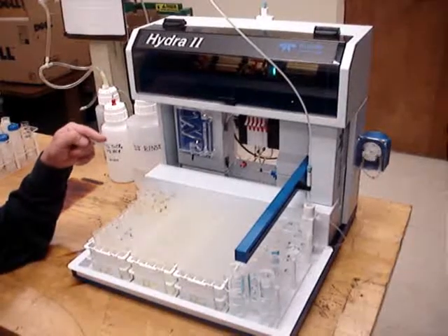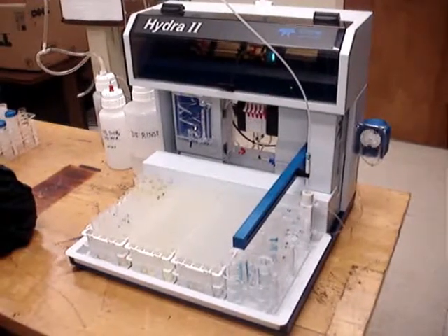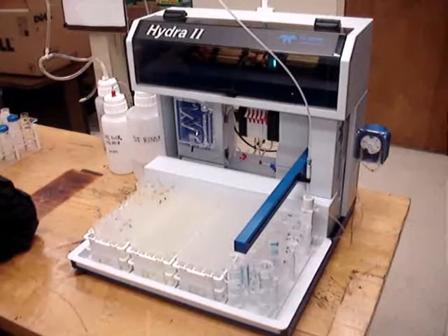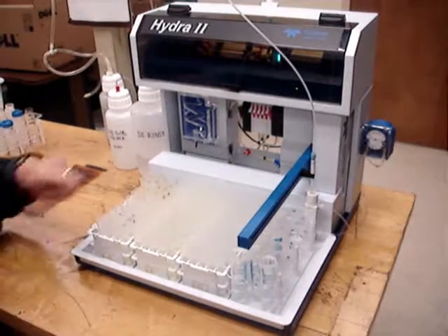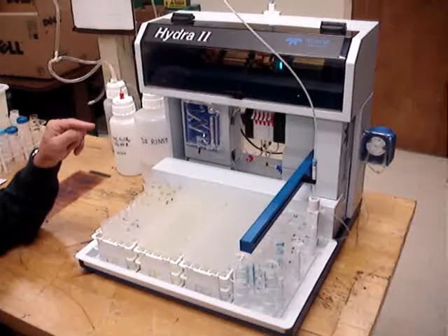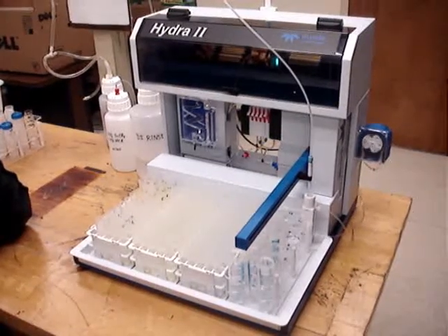Right now we're going through the sample rinse cycle. The system software will be monitoring this rinse signal until it reaches a stable value — that's part of the smart rinse routine. You can see the peristaltic pump running in the background, which is supplying fresh solution to the rinse station at this point in time.